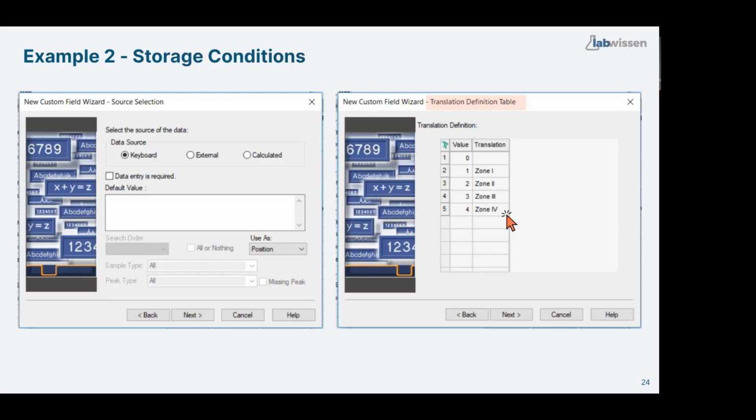Just a little trick for how you do it, because I've seen it many times. People created their options and then wondered, can't I put anything else inside, only these options? So it's quite useful to leave the empty one. And yes, you're unlimited. Maybe someone who is curious can try to find out what the limit is. Write me then, I'm curious too. What is the limit?